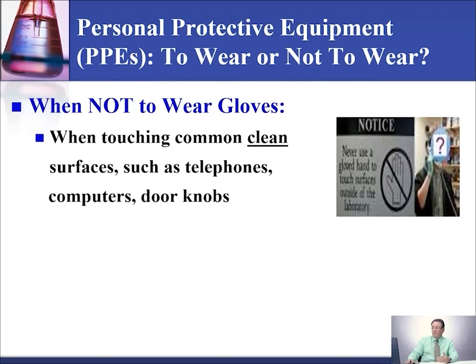When not to wear gloves: when touching common clean surfaces such as the telephone, computer, and doorknob. For the telephone and the computer, by the way, if they are in a dirty area next to a bench and you need to answer the phone or enter a result using a computer, that cannot be a clean phone and a clean computer.